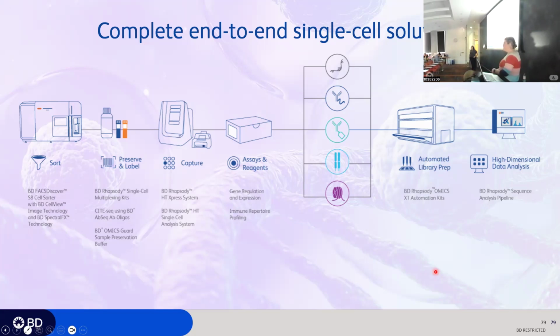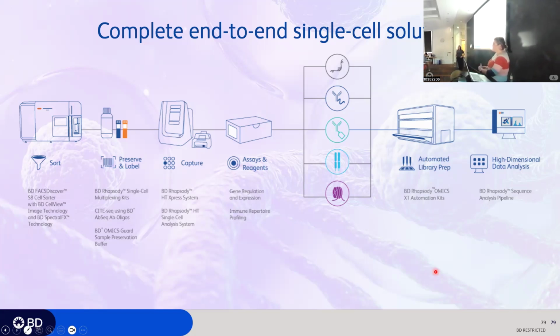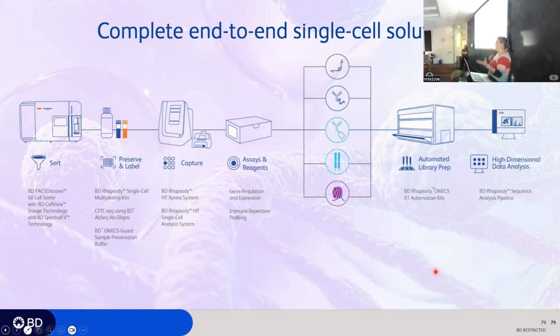How do you prevent more than one cell entering into a single well? So this has to do with how you prepare that single cell suspension. We want to make sure that if you're working from a tissue, for example, that it's well digested and that we've run it through some filters to break up clumps. There will be multiplets. Every platform deals with multiplets. But our scanner actually has a predicted multiplet calculator on it based on the counting that you do. So if it looks like it's going to be a bit high, we can filter it again.